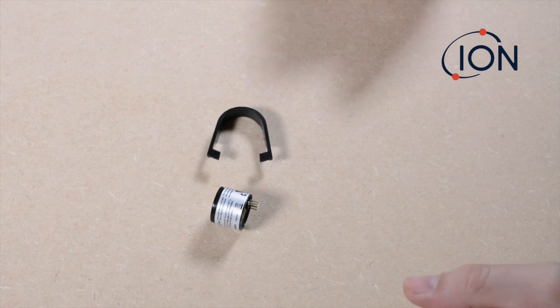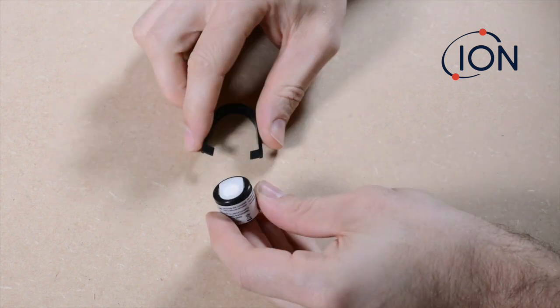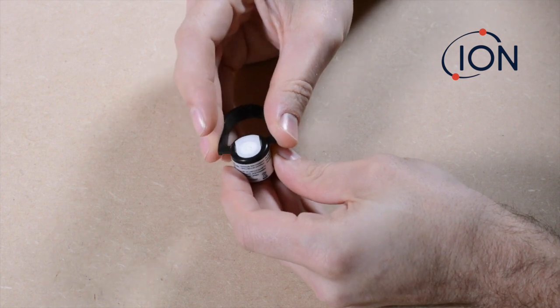Position the mini-PID so that the electrode stack is face up. Then, using the removal tool, align the arms of the removal tool so that they fit within the two slots on the mini-PID body.